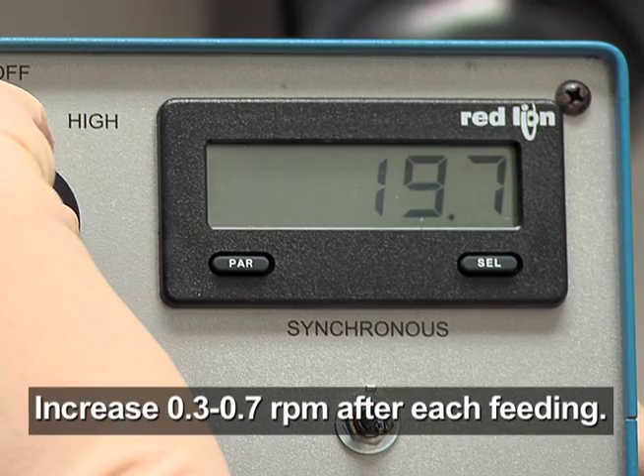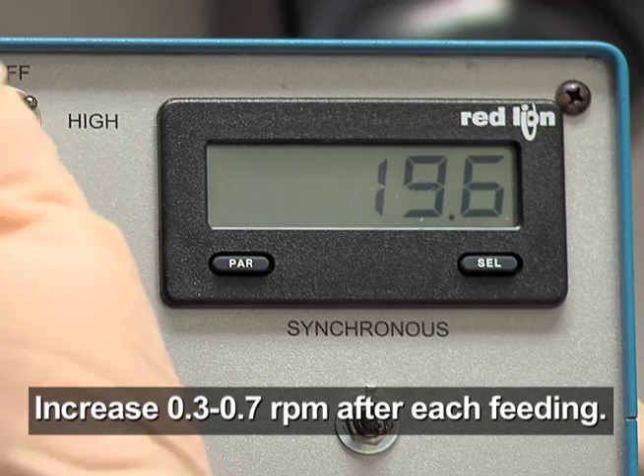Once the aggregates start growing visibly, increase rotation speed to ensure the cells remain in suspension.